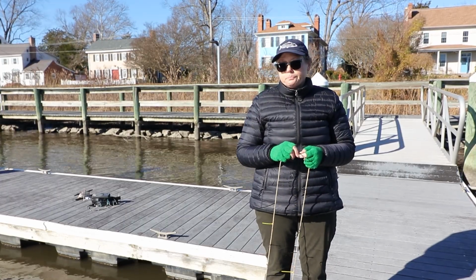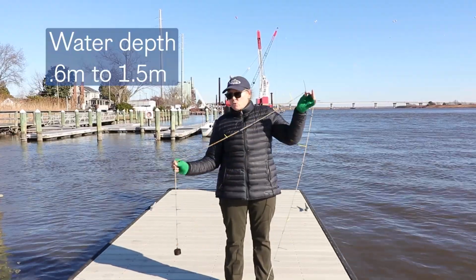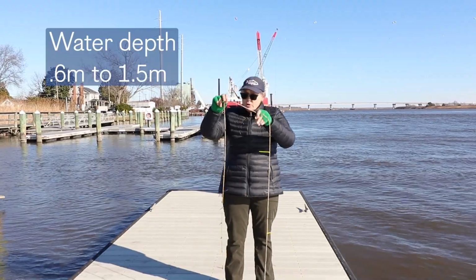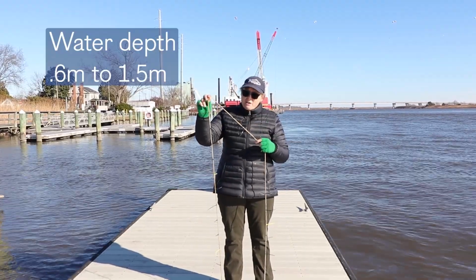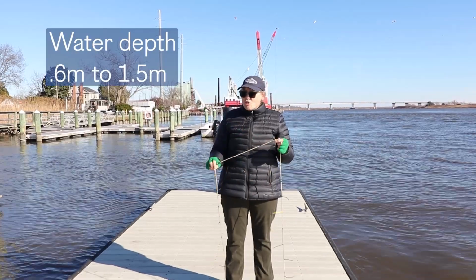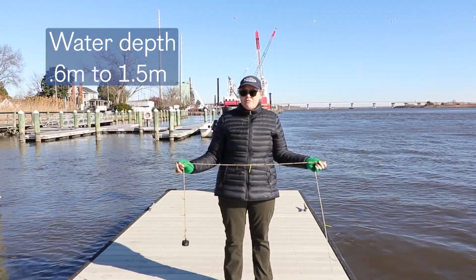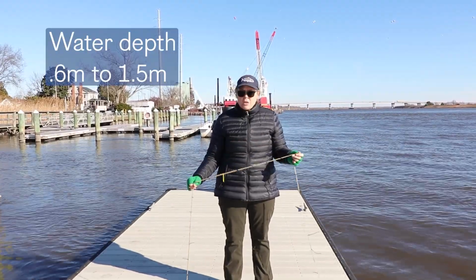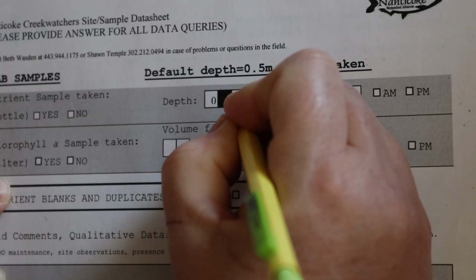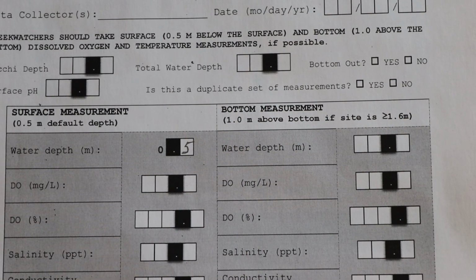profile area. If our total water depth is somewhere between 0.6 all the way up to 1.5 meters, then we're only going to take a surface water measurement, and we're going to do that at the 1/2 meter mark. This will be both our depth where we take our water samples and our surface DO water measurements.